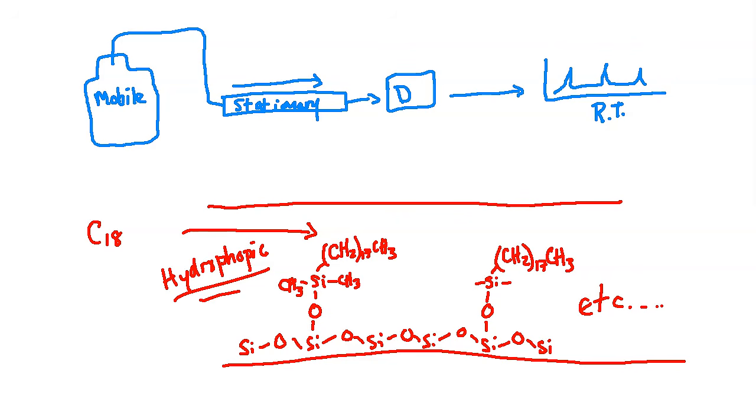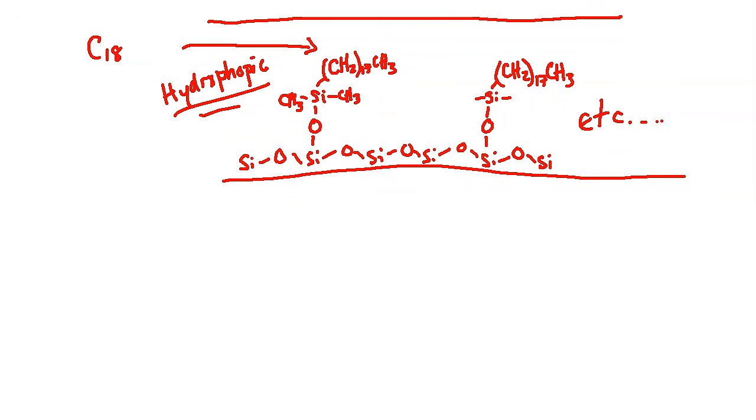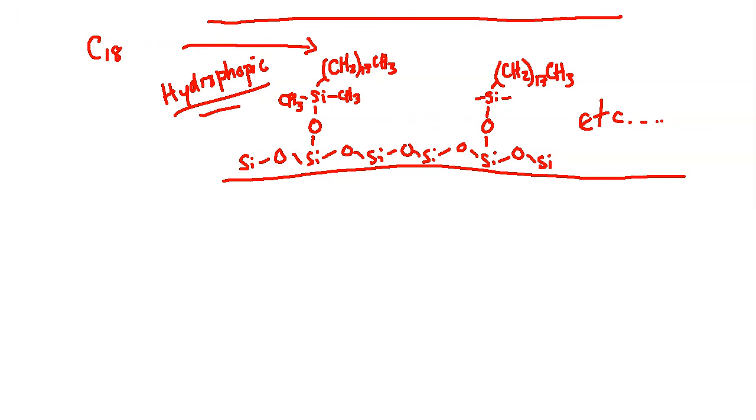Okay, now this is very important. The choice of column and solvent phases will always play a role in your separations, and you want to basically maximize the efficiency of those separations, which again could be its own lecture in terms of how do we maximize retention time, how do we get good resolution so the peaks aren't too clustered together, and we'll address that as we go along in this course. So what are some of the modes of HPLC that we can talk about?